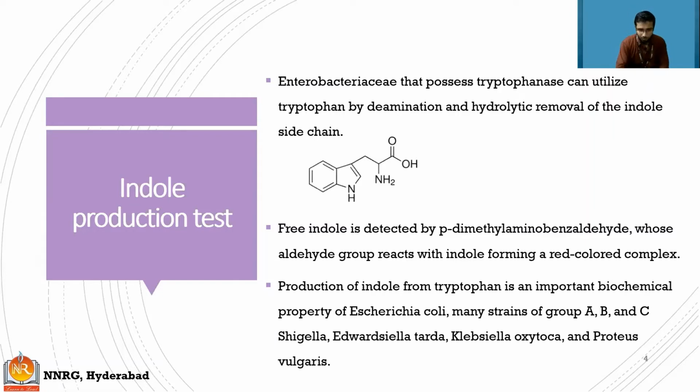Let us see next point. Free indole is detected by para dimethyl amino benzaldehyde. Benzaldehyde, benzene with aldehyde group is benzaldehyde. When it says para dimethyl amino, it means to the benzene ring.